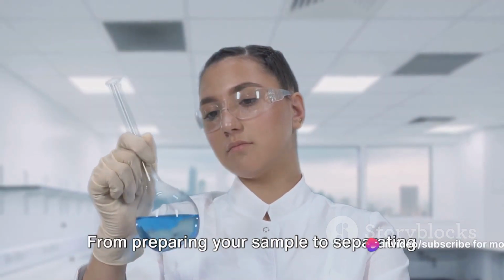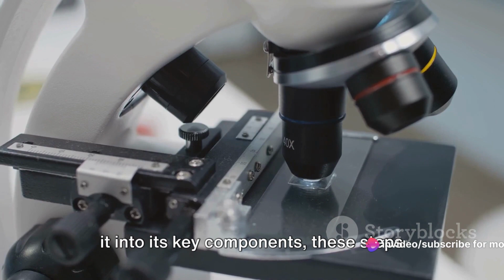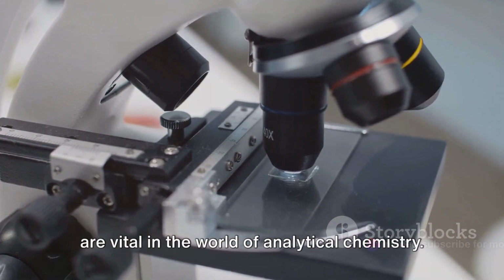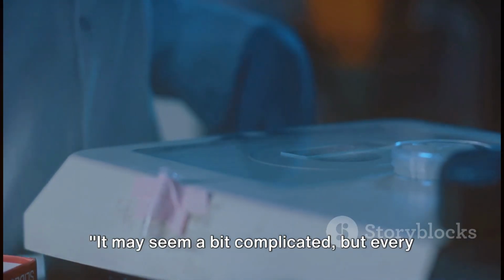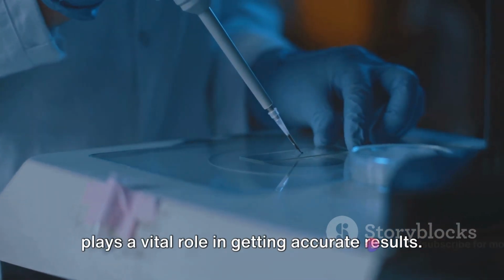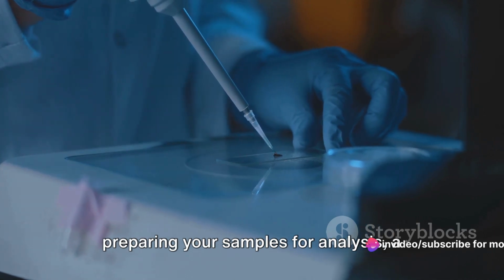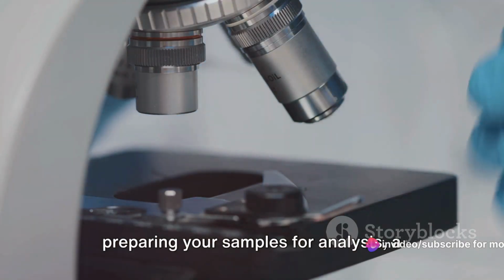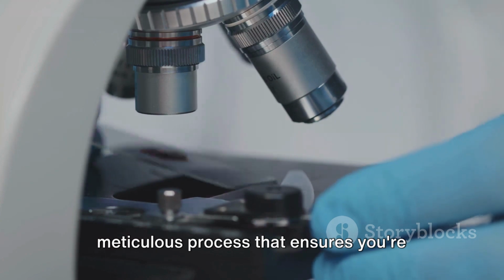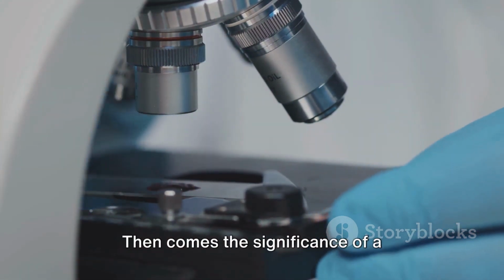So there you have it. From preparing your sample to separating it into its key components, these steps are vital in the world of analytical chemistry. It may seem a bit complicated, but every step in the sample preparation process plays a vital role in getting accurate results. Remember, the journey begins with preparing your samples for analysis, a meticulous process that ensures you're starting with the most representative piece of the material under study.